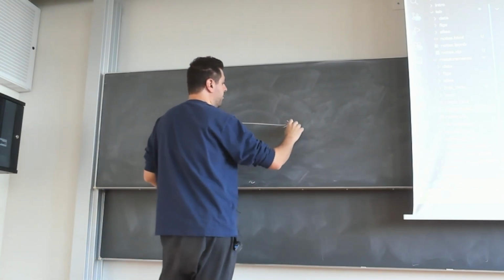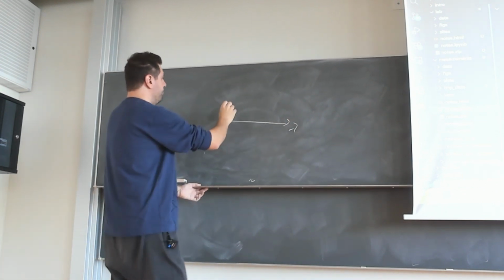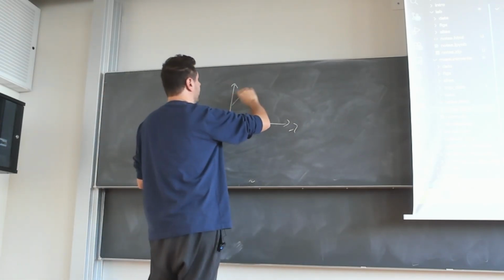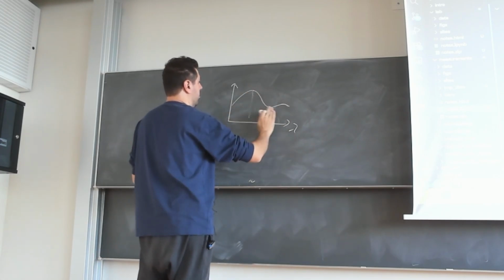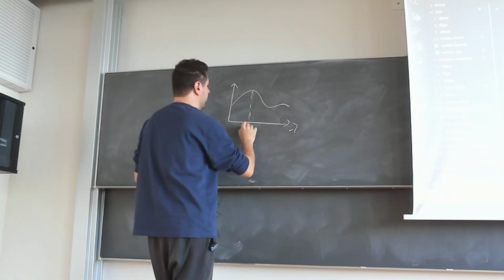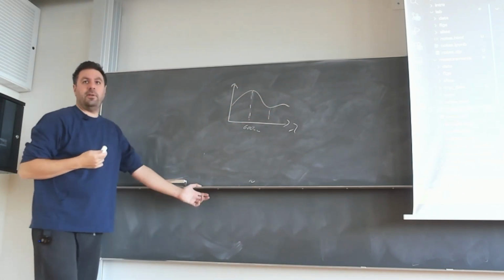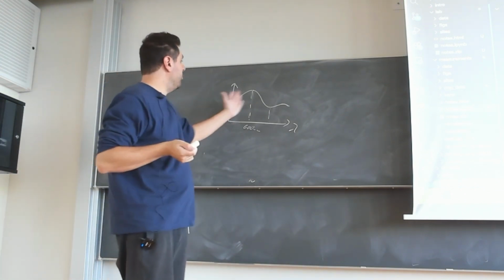You will have here the wavelengths, and you will here have kind of the optical density. And for example, let's say this is at 600 nanometers, but that at 700 it looks, for example, like this. So you get something that is called a spectrum. It is kind of like the absorbance at different wavelengths.